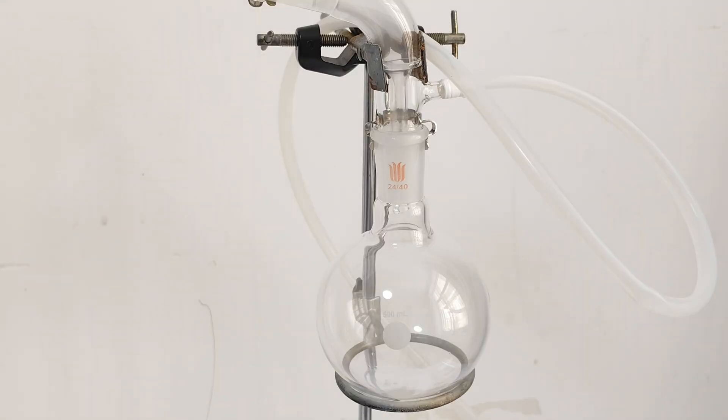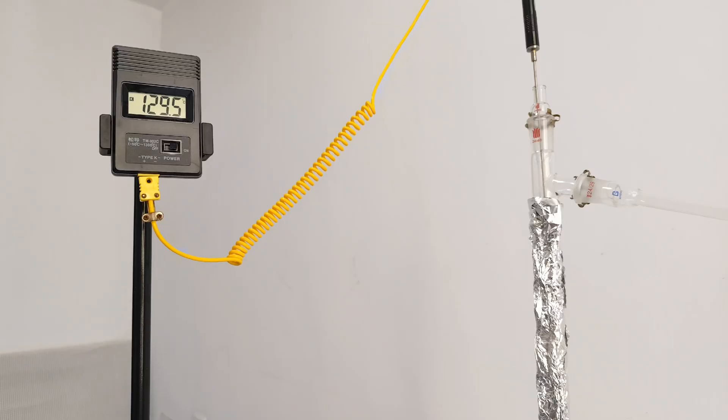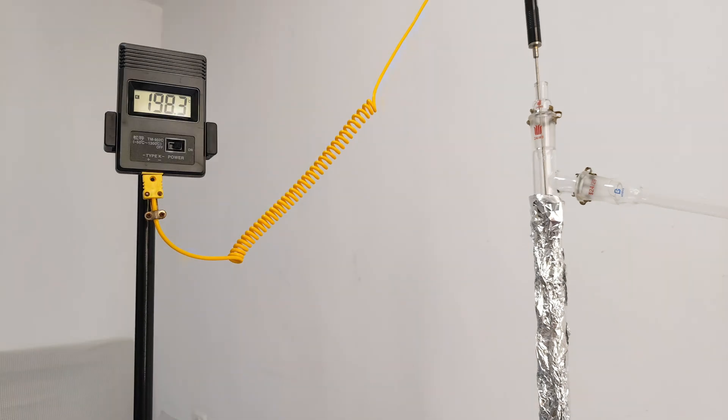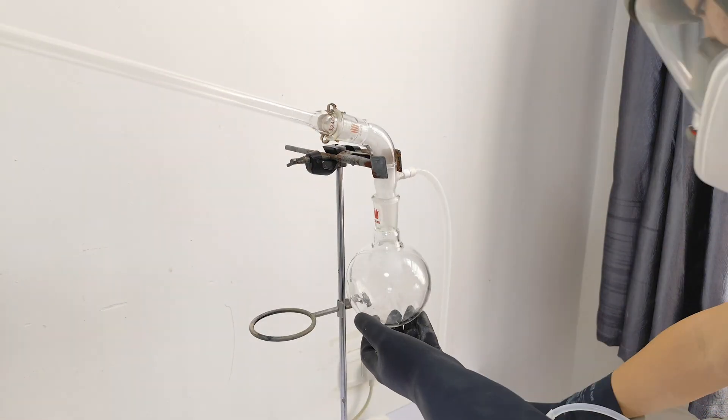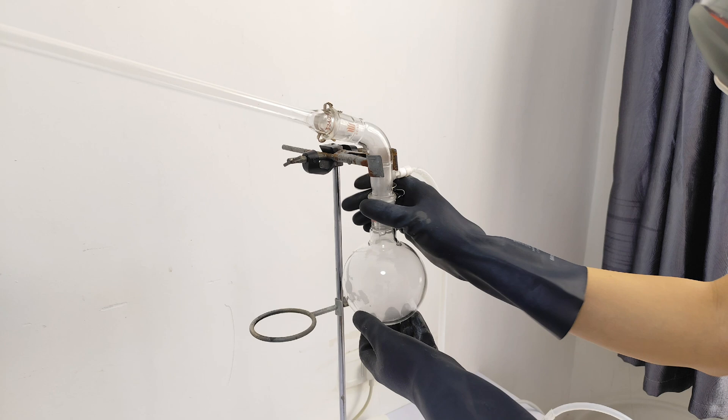Meanwhile, some liquid is coming out and getting into the receiving flask. But the thermometer shows that the boiling point of the liquid is only about 130°C, which means the liquid is probably just some water. About half an hour later, the temperature climbed up to about 330°C and stayed. So I changed the receiving flask to a new one to collect the part with higher boiling point.